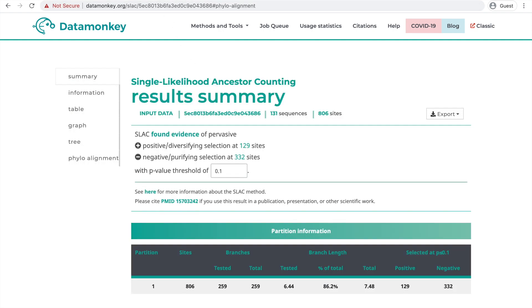Here we can see the finished results for the same dataset. You'll see some basic information about the file you ran, and if there were any sites with positive or negative selection, how many of those sites there were, and the p-value threshold with which those sites were detected. You can change this p-value threshold to suit your needs. Since we used an HIV dataset that we know has been affected by drug resistance, we know selection is acting heavily upon it, which is why we see so many sites with both positive and negative selection here.